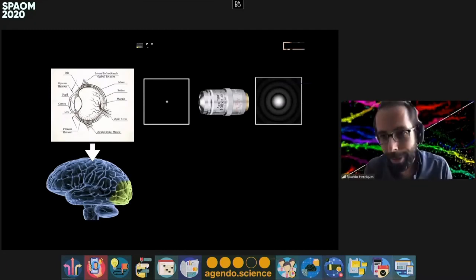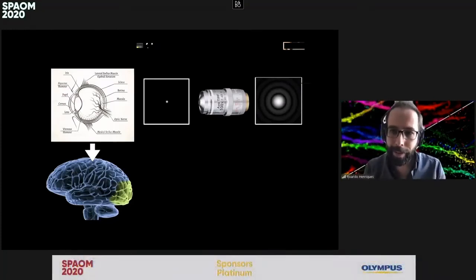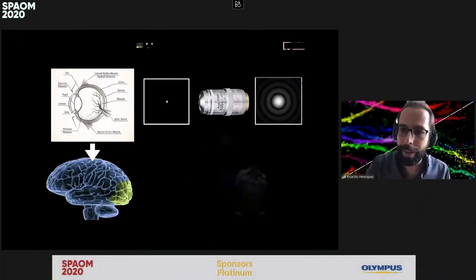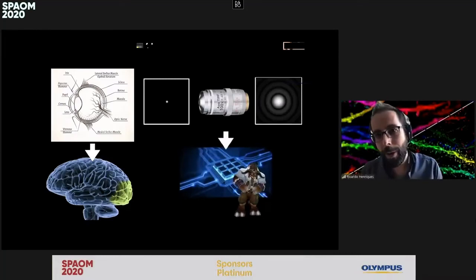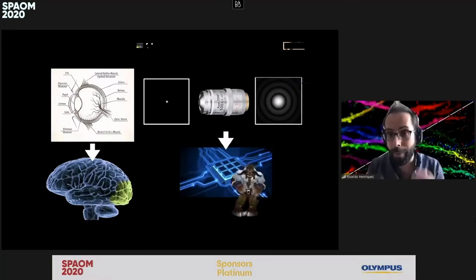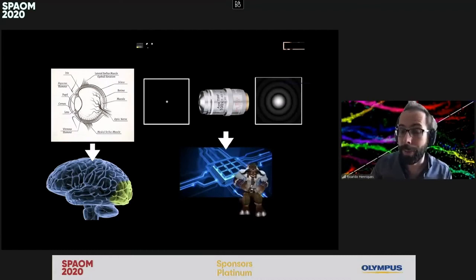I could argue this a little bit, and there's some beautiful work done by Andrew York, for example, in trying to improve the way that we design objectives. But it's not major changes to that architecture at the end of the day. And the revolution now is actually in the way that, given those limitations on the physics of glass, we're able to extract more and more data from it by digital analysis. So it's a really cool moment in time because of this.